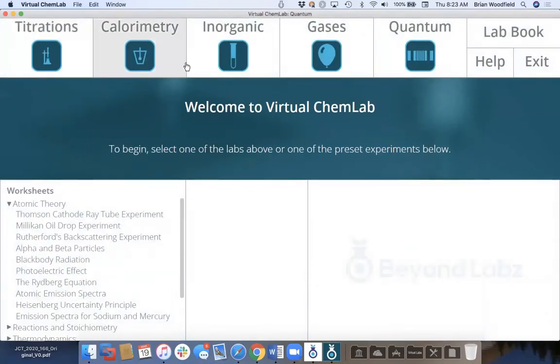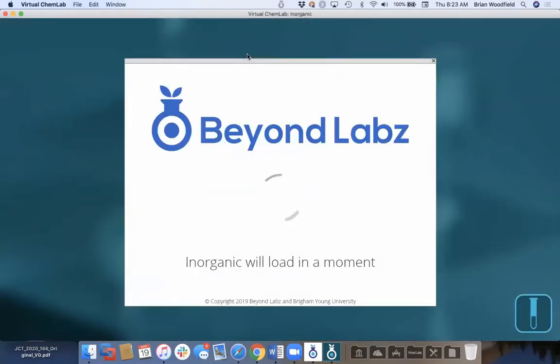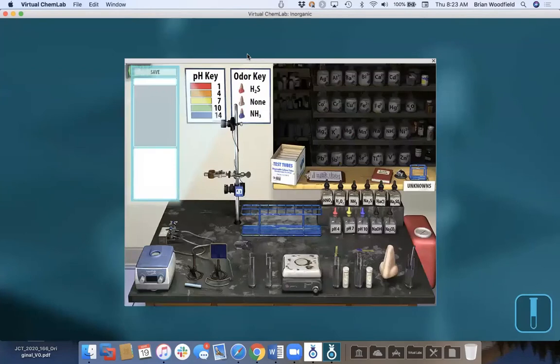And then each of these benches is the same, all right? So again, quantum is something that's not going to reproduce something you're probably doing in the lab already, but it is cool to use for your lectures and just give it as homework, and give it as group work, have students work together in some way.